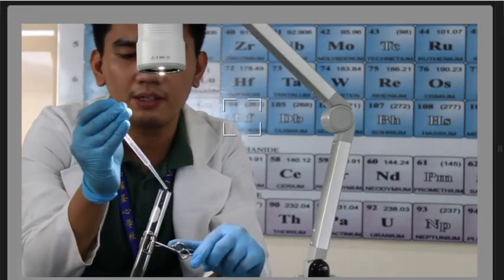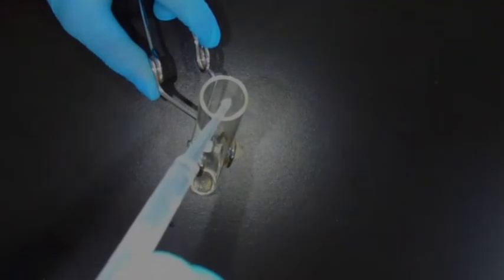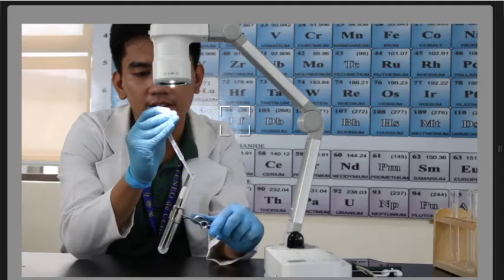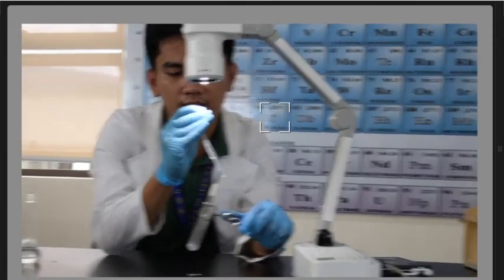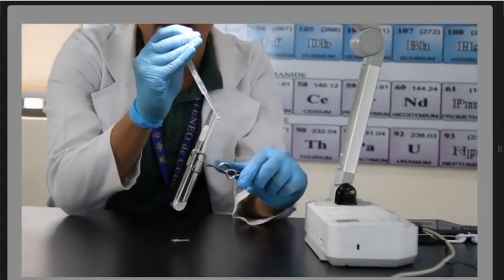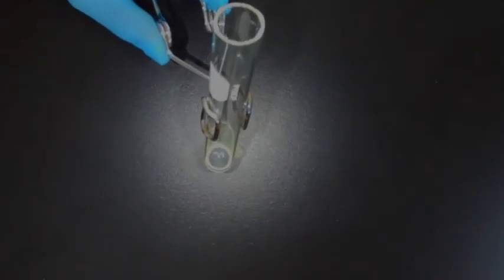So notice the reaction. 1, 2, 3, 4, 5, 6, 7, 8, 9, 10, 11, 12, 13, 14, 15, 16, 17, 18, 19, 20 drops. So that's 20 drops of sodium hydroxide. So observe the reaction.